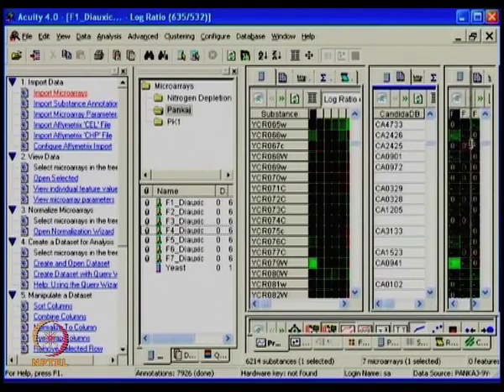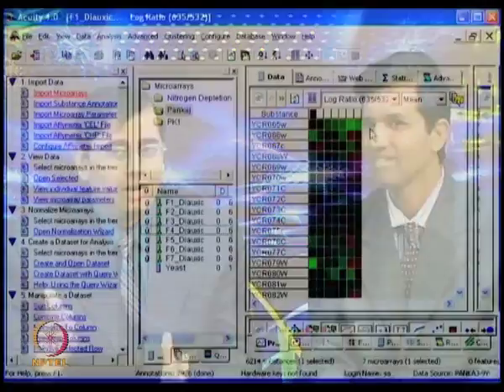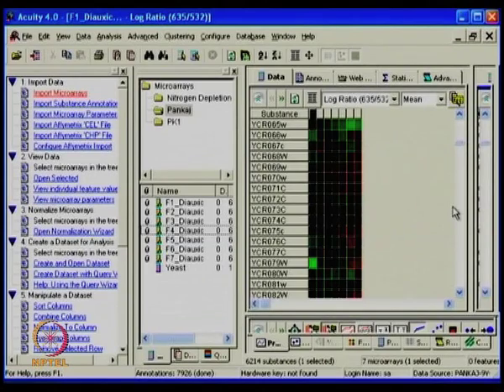So how you want to look and customize your view. I think these types of heat maps right away give you a feel about what type of genes across each time point have shown variation or modulation in the expression profile. Looking at the color itself, like for the first one, I can easily say it's going down as we are moving towards the 20th hour.